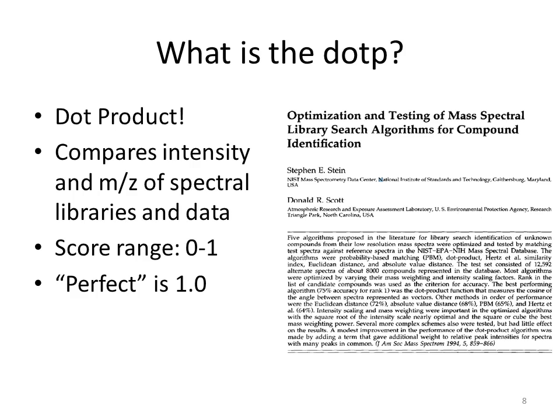What is the dot product? This is something that is really helpful when you're going in to look at your spectral library and then you're looking at triple quad data to see, is this the right peak? Because you don't always get a beautiful peak in your chromatography. Sometimes you get a choice of a dozen. Sometimes you get a signal that's so low it's in the grass, and it's really hard to know if you're picking the right peak. And so dot product is a way to correlate the contribution of all of the product ions that's observed in the spectral library, so mass to charge and intensity, with what's observed in your actual data.